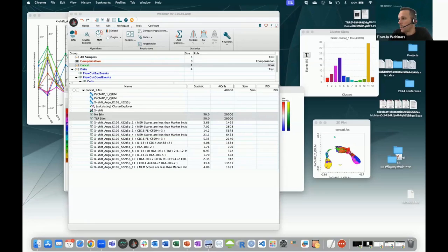Yeah, so for the question earlier, I did answer already. What markers need to be selected for running your dimensional reduction? Basically, all your markers except the ones you take out. So for me, it was my lineage and live/dead markers used to define my population. If you define your population with your CD45 marker before you concatenate, for example, you remove the CD45 marker. So everything that you already used for your manual gating, just remove it.